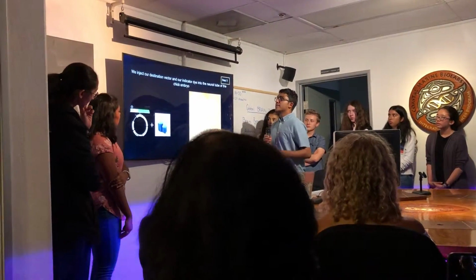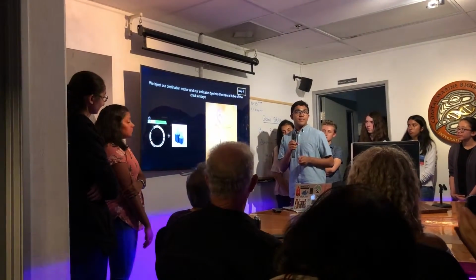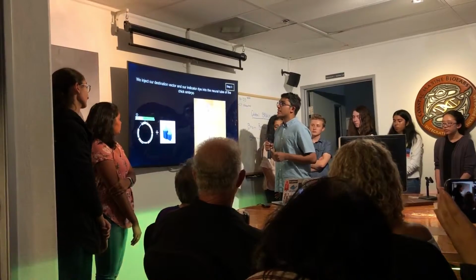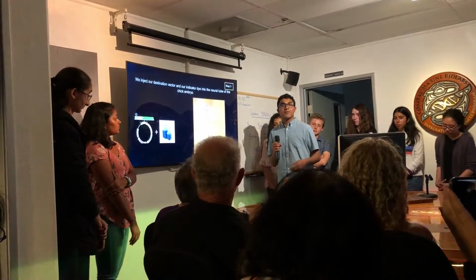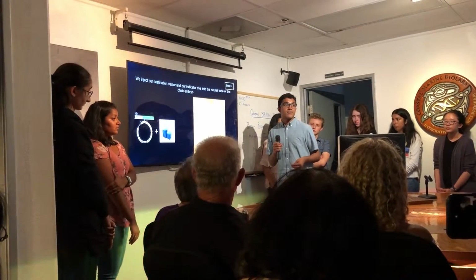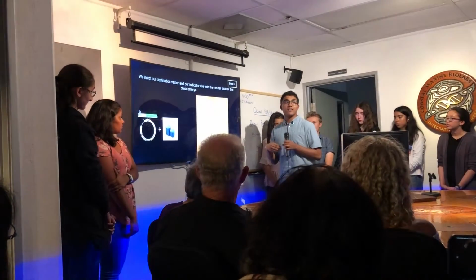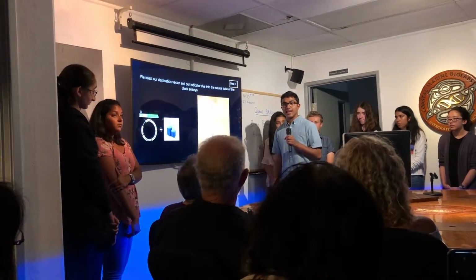So we inject our destination vector and indicator dye into the neural tube of the chick embryo. We use indicator dye because we need to see that we injected our destination vector into the correct region of the chick embryo. If we only injected our destination vector, we would not be able to see where we put it because DNA in a liquid naturally is transparent. So we would have no idea whether we got our DNA into the right spot. We inject our ECR into the neural tube because the ECR controls gene expression in the neural tube, as shown by scientists at the Lawrence Berkeley National Lab.